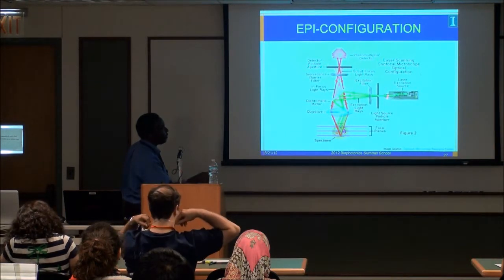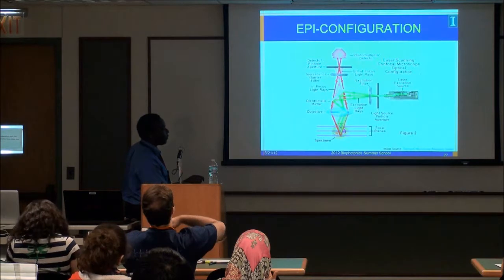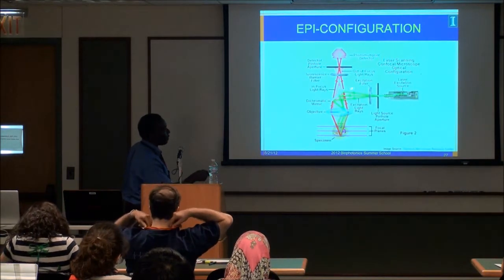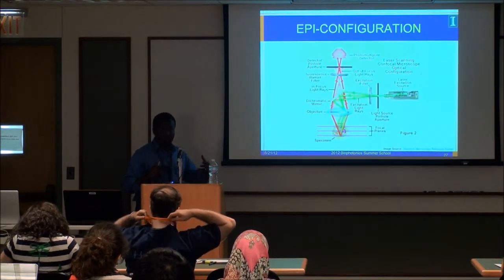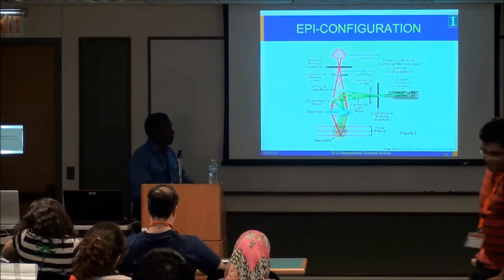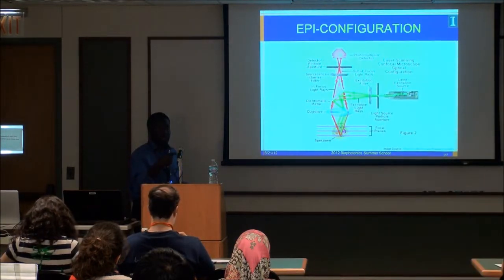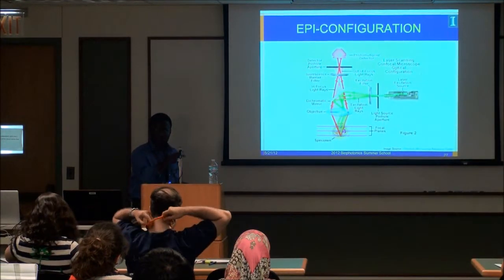If this were a confocal scheme, one typically has pinholes placed at the right positions, like here, detector pinhole, light source pinhole, and one may use a galvo pair of mirrors. This dichroic may be some type of galvanometer scanner so that it scans the position of the beam along the XY direction onto the sample. Scanning the beam is much faster than scanning the sample.